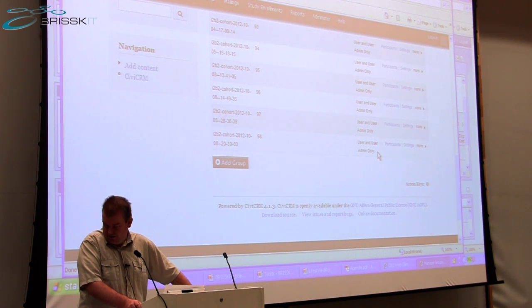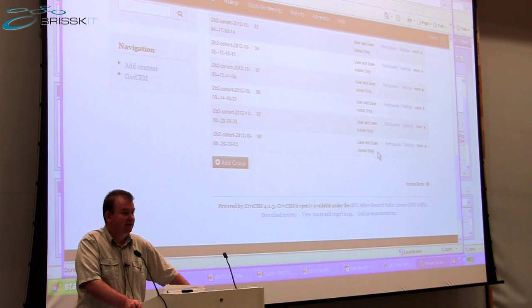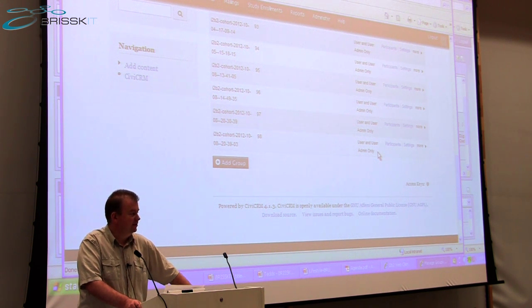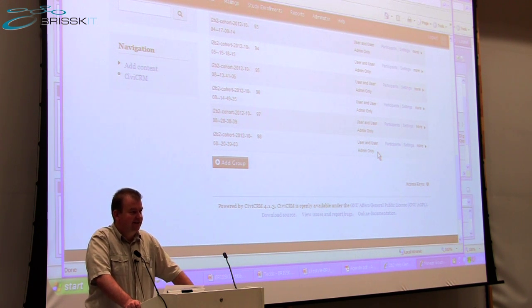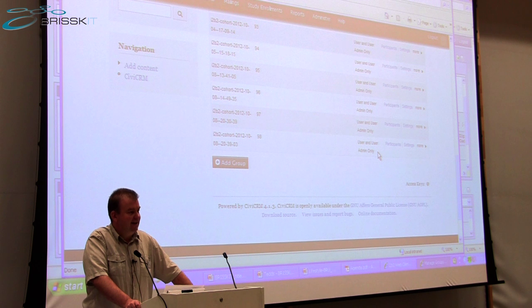Ollie, have we covered everything that you wanted to demonstrate? I'm happy to take a couple of quick questions on anything that we've shown you, but as Malcolm alluded to, I think there's plans in the rest of the day and time in the rest of the day to get down into a bit more detail about individual applications if people have got particular interest in one or other of them. Yeah.